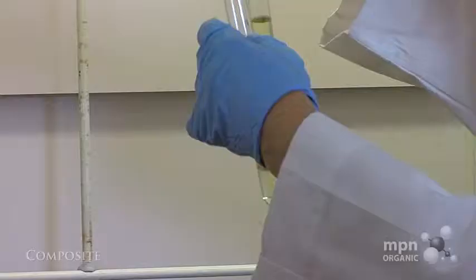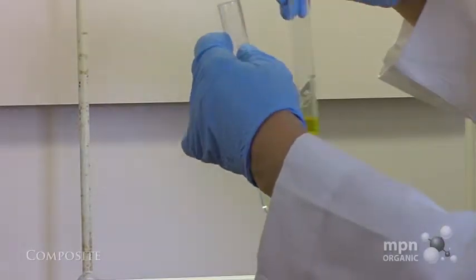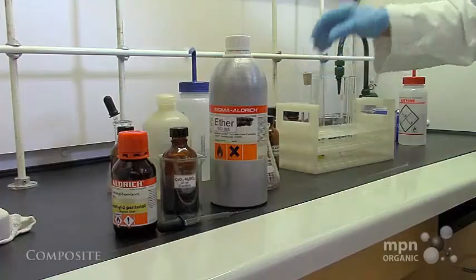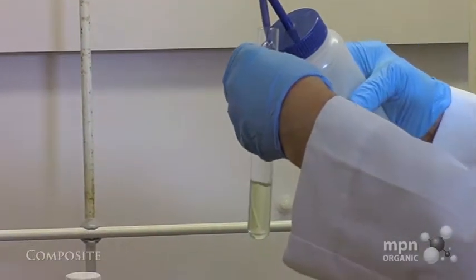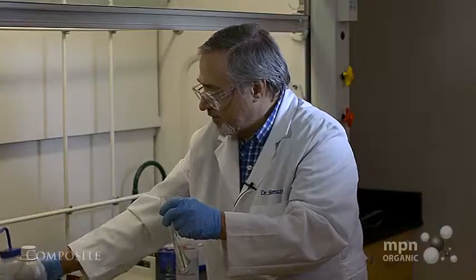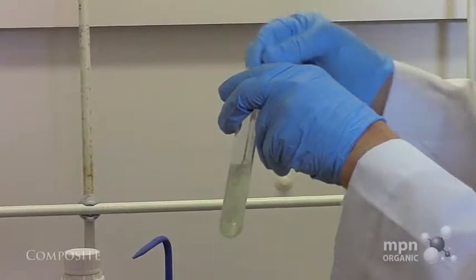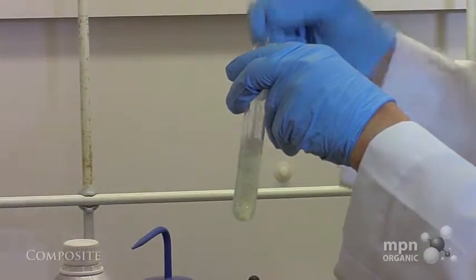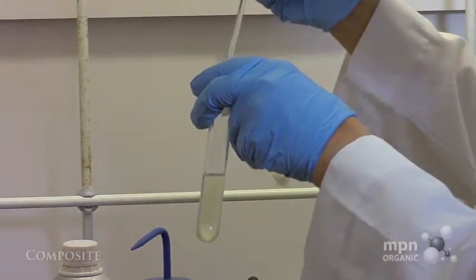Okay, so let's get some water. And now let's wash it again with some water. Once again, let's mix it up and see what we get.